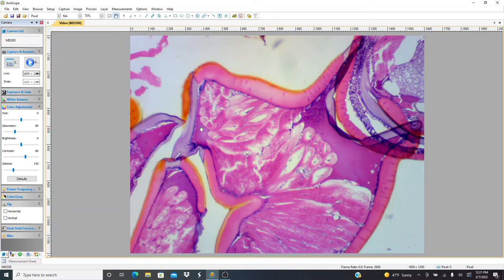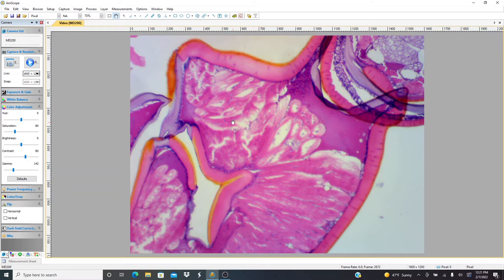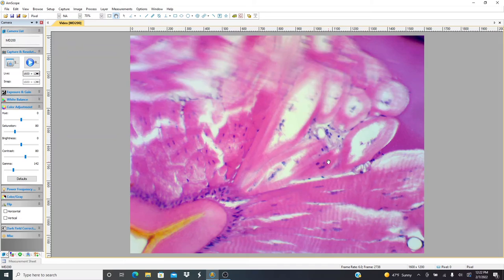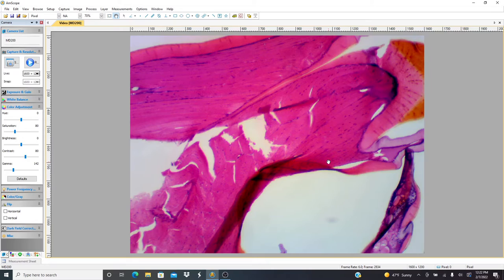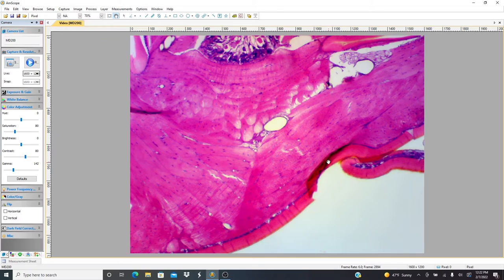So anyway, heading down the body of this thing, you can see the body of it is loaded with skeletal muscle. I mean, all this tissue in here is skeletal muscle, which tells me this is a very muscular animal. I think that's kind of cool. And look at the cross banding on that. It's just packed with muscle. Going over here, we see a lot of these chitin layers. I'm not sure how deep we actually cut into them on histology, but I just can't believe these things are packed with muscle. It's almost like eating a piece of meat if you were ever to eat this thing.